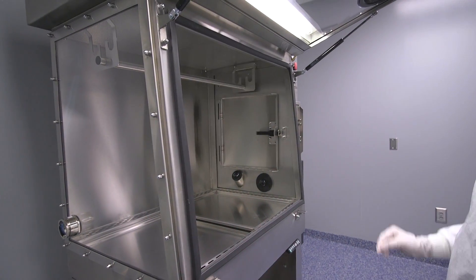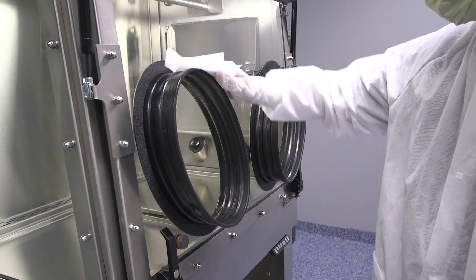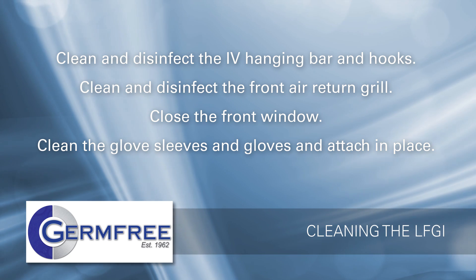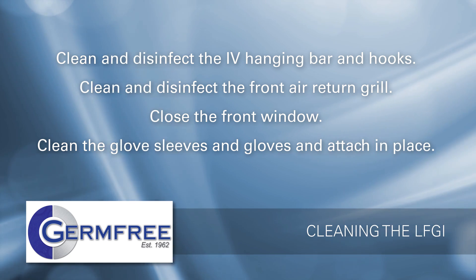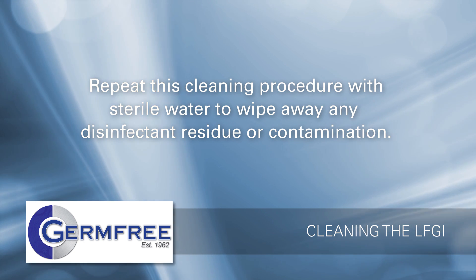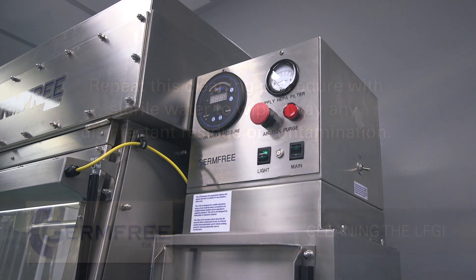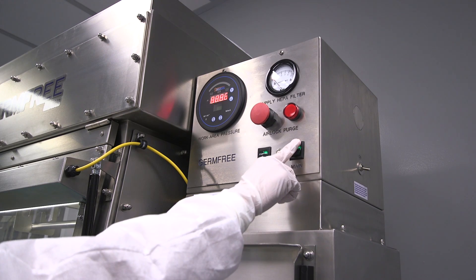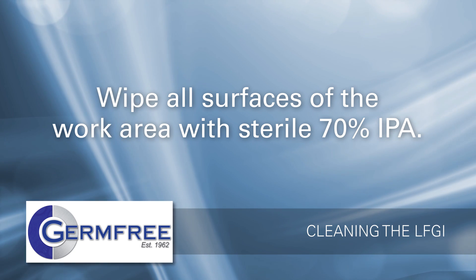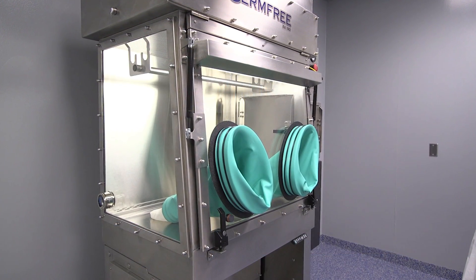The glove sleeves may be removed for cleaning or replacement. Clean the open front access window from top to bottom. Use a disinfectant wipe to clean the glove ports. Clean and disinfect the IV hanging bar and hooks. Clean and disinfect the front air return grill. Close the front window. Clean the glove sleeves and gloves and replace them on the front window. Without removing the sleeves and gloves, repeat this cleaning procedure with sterile water to wipe away any disinfectant residue or contamination. Turn the LFGI on and close the front access window. Wipe all surfaces of the rest of the work area — including under sliding work trays, the inside of the front access window, and the gloves and sleeves — with sterile 70% isopropyl alcohol. Allow the LFGI to run for 10 minutes before use.